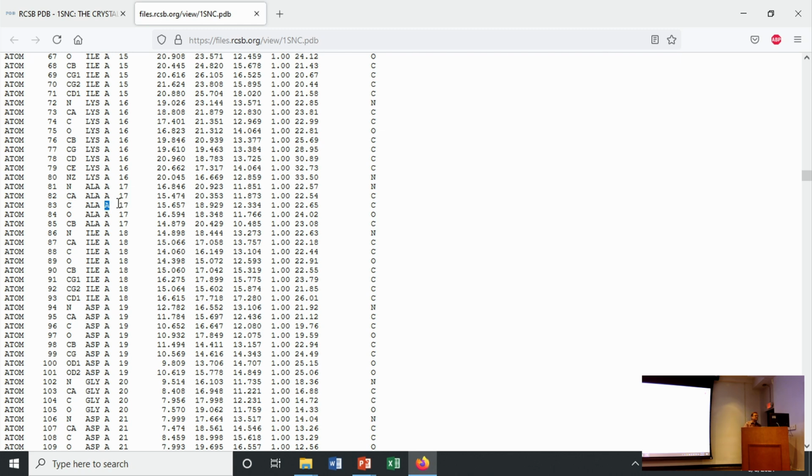There's occasionally some other data here. Like, for example, sometimes you see multiple conformations in the structure. And so maybe some of the molecules crystallize this way, or a side chain is crystallized in this way, and other molecules crystallize in the other way. So one's this way, one's that way, and you'll see a mixture of both, right? And so sometimes the experimentalists say, well, I don't want to pick one, because the data have both conformations in there, and so they'll give them an A and a B conformation. And so sometimes you see multiple A's and B's here.